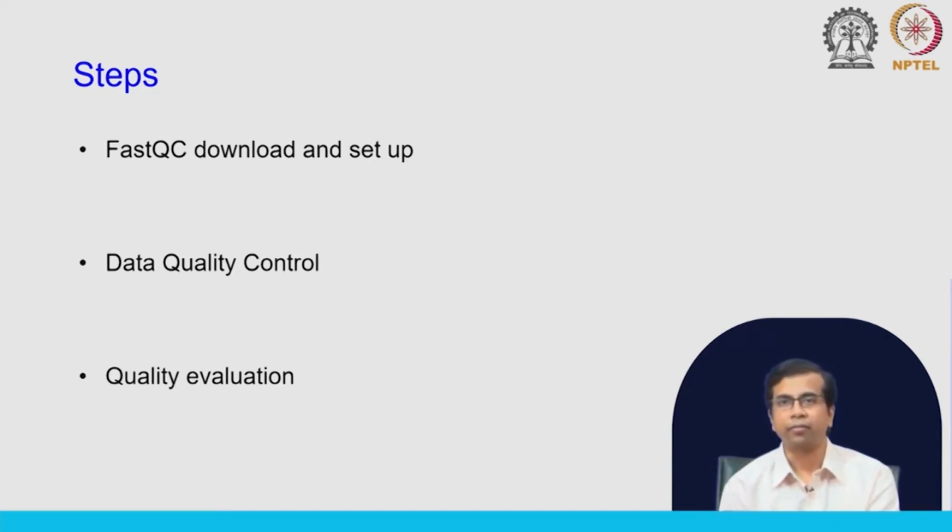And as we have discussed, FASTQC will generate certain statistics for you and we need to make sense of that statistics, and we would have to make decisions ourselves, right. What do we want to do before we actually go for downstream analysis? Do you need any pre-processing? Do you need any trimming? Those decisions would have to be taken by us. Okay. So, let us start.